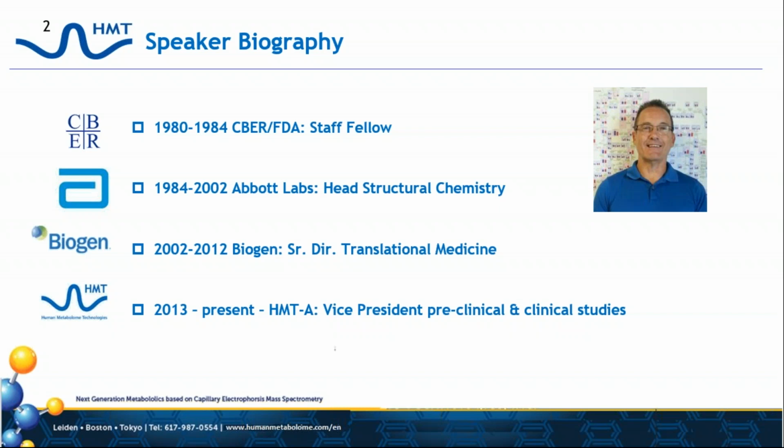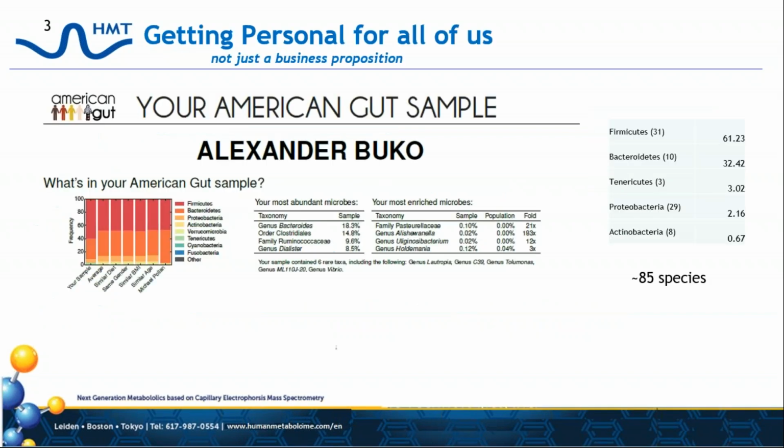and medical centers. Today's talk will focus on the microbiome and our ability to use CEMS to measure metabolites in various sample types. And I want to say that the microbiome is something that's not just a business proposition, but something that all of us may have an interest in, as the association between the microbiome and our health starts to gear up, and we learn more and more about that association.